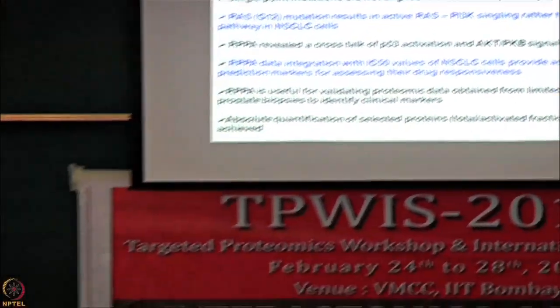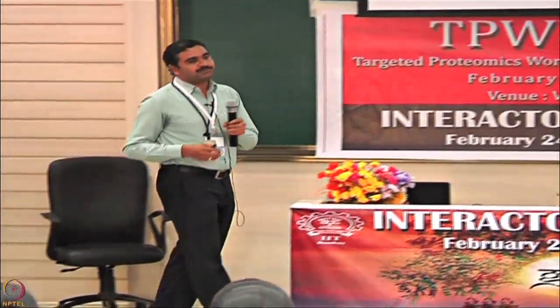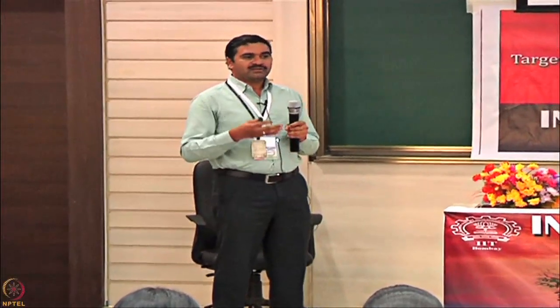But all in all, now you might have understood that the necessary steps to follow, printing and then hybridization and all steps, are the same. The only difference between forward arrays and reverse arrays is that here you spot just a crude lysate. You don't have to follow any separation of samples. So in one experiment, on one slide, you can estimate the quantity of a particular protein of interest across a large number of samples.